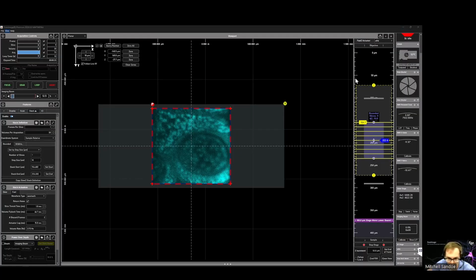So now from the one window, we can click grab or loop to start our fast stack. Now, since fast C stacking goes through each slice very quickly, we leave control of this display slider to you. You'll notice the images are slightly noisier here, and this is actually a feature and not a bug.